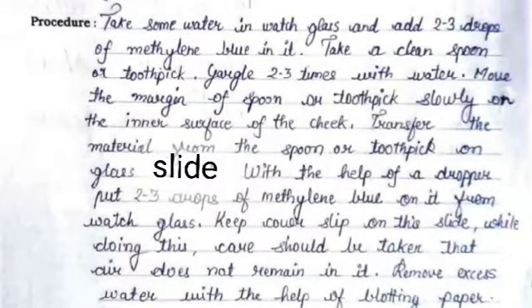And the procedure is: take some water in a watch glass and add 2-3 drops of methylene blue in it. Take a clean spoon or toothpick, gargle 2-3 times with water. Move the margin of the spoon or toothpick slowly on the inner surface of the cheek. Transfer the material from the spoon or toothpick on a glass slide. With the help of a dropper, put 2-3 drops of methylene blue on it from the watch glass.